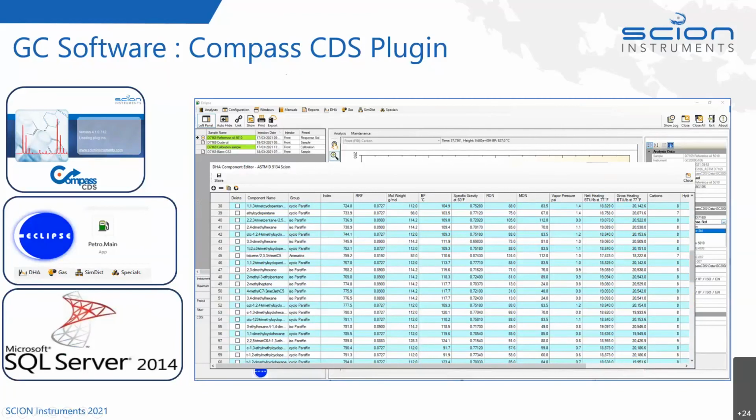It's got them listed into their groups, whether it's a paraffin, an aromatic, or a cycloparaffin, and alongside here it's got its Kovats index, so that it will already be able to automate calculating the Kovats index for the unknown peak and then comparing it with the database to label the peak. We can also gear the algorithm for whether it wants to look biased towards more alkanes. So there are some other presets we can add to the search tools when it's looking up the database. And inside the database, you can see it has the boiling point, also specific gravities, and a lot more information inside the database itself.